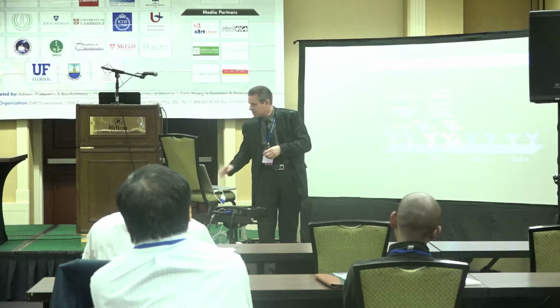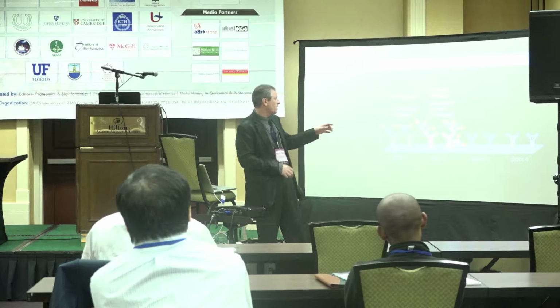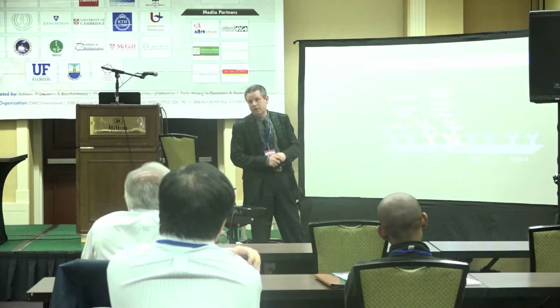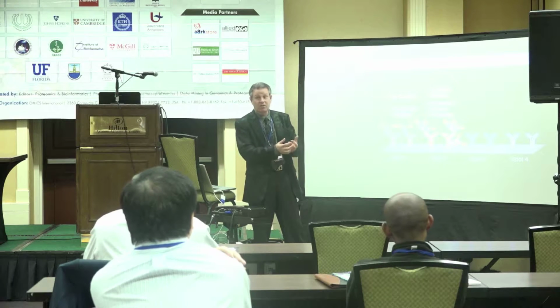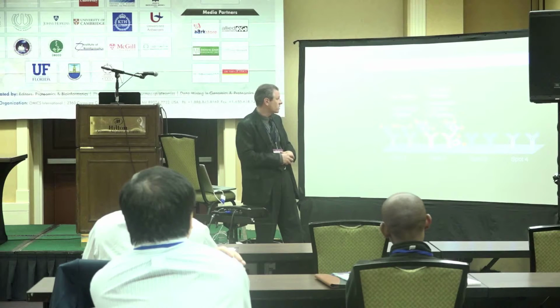But most proteins inside cells are in complex with other proteins. So in fact, what you really can often have is a situation where the target protein is binding and has dye signal, but associated proteins are also binding, and they contribute to the dye signal. And what you're really looking at, where there's a change in the signal, is a change in protein-protein interaction. Not the level of the target protein, nor its phosphorylation, but this interaction.